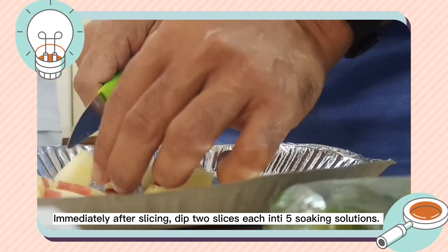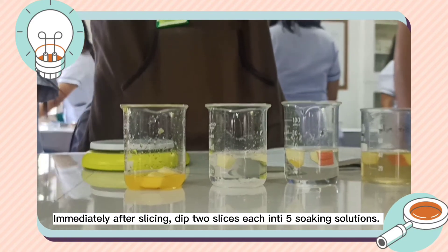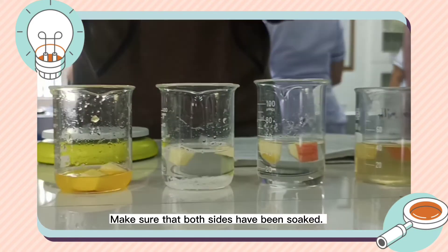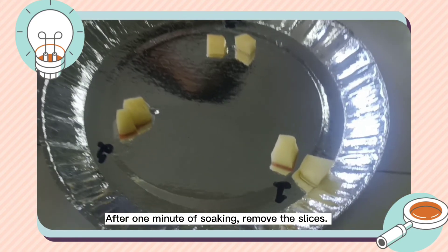Immediately after slicing, dip 2 slices each into the 5 soaking solutions. Make sure that both sides have been soaked. After 1 minute of soaking, remove the slices.